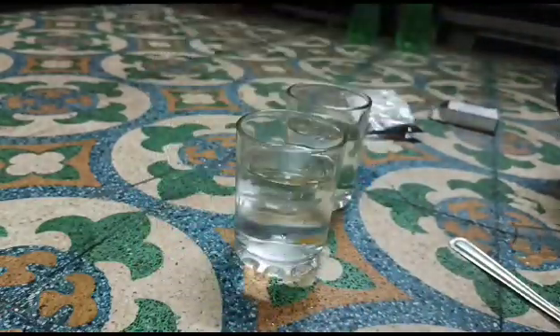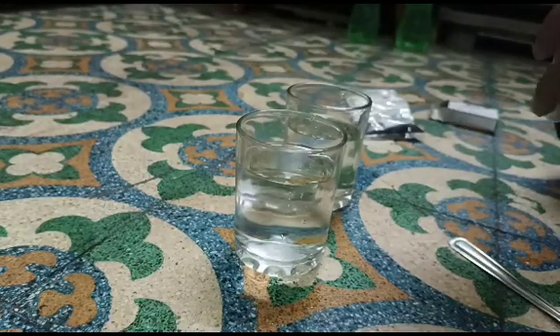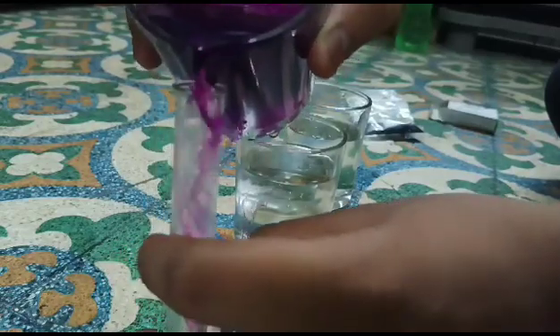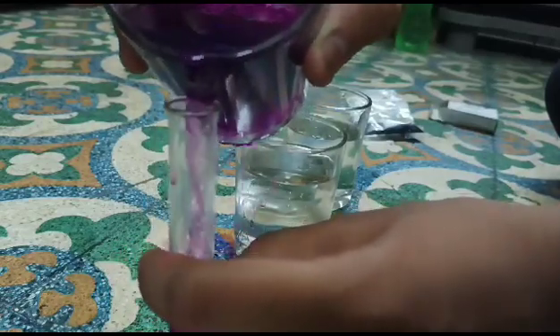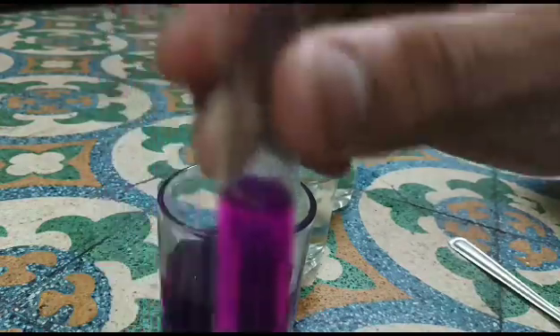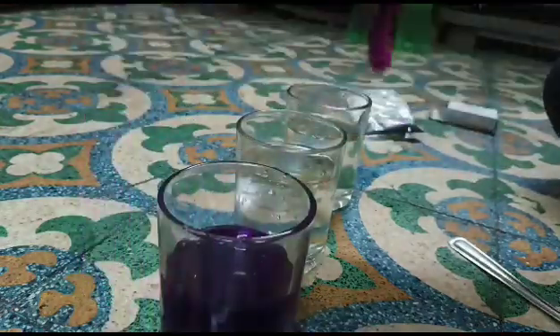Got it? Now take one test tube or any container and fill it estimatedly around 10 ml. Now see, this is purple in color, obviously because it is purple powder.